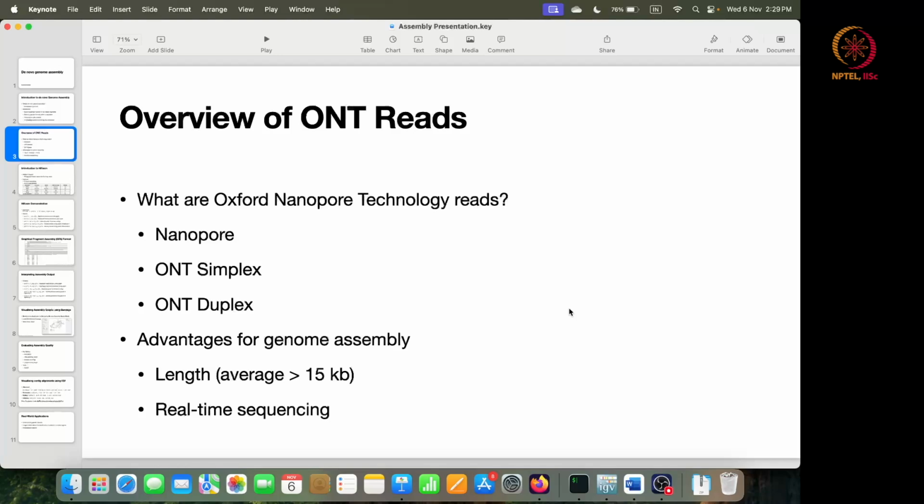When DNA is sequenced, it is fragmented into smaller chunks, and each of these chunks are passed through a protein called a nanopore. Current is continuously passed through this nanopore, and the amperage across the nanopore is measured. Based on which molecule of the DNA is passing through the nanopore at any given instant, we are able to infer the molecule based on the current that is observed.